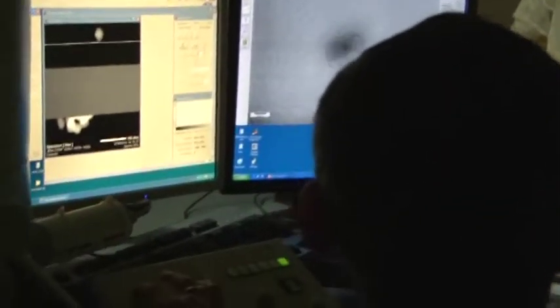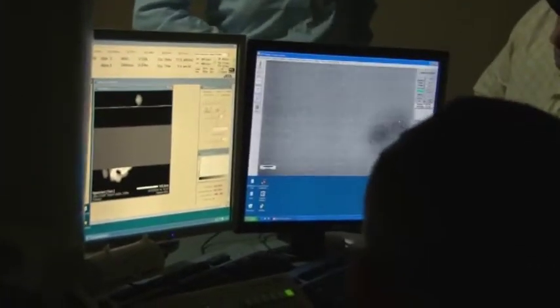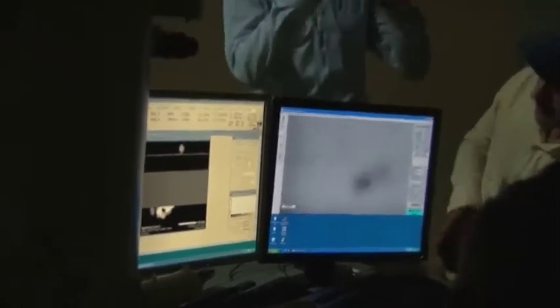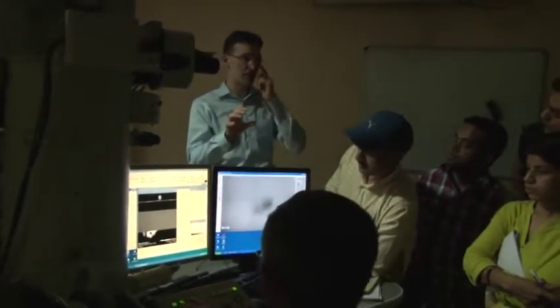So you see, it's vibrating, and we try to minimize that vibration. So I have pressed this Z plus button. It's probably improving. I have a feeling. Maybe I can't be sure. So this is another tilt in the objective lens, you know.